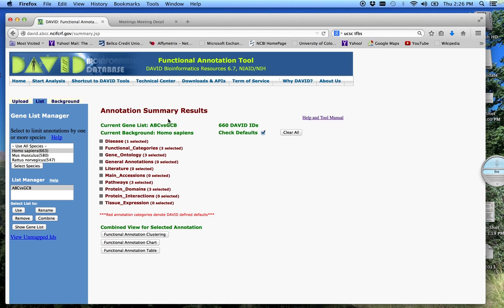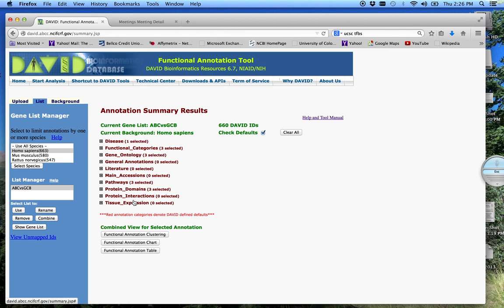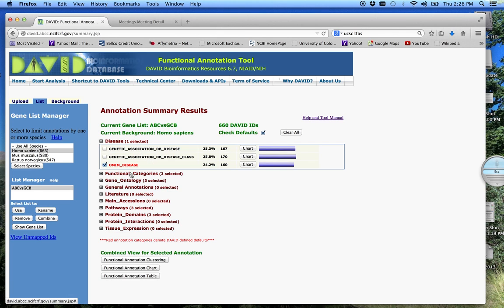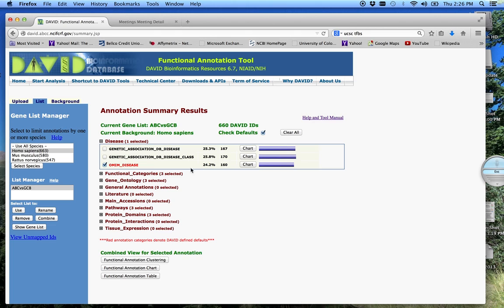This is the Annotation Summary Results page, and basically what it does is list some of the functional categories and databases that it used to organize these genes. It runs the gamut from disease, ontology, tissue expression. We can look at one of these. The databases are listed on this side. The percent here is the percent of our gene list that will fit into one of these database categories. This is the number of those genes, and then you can find the genes in this chart.